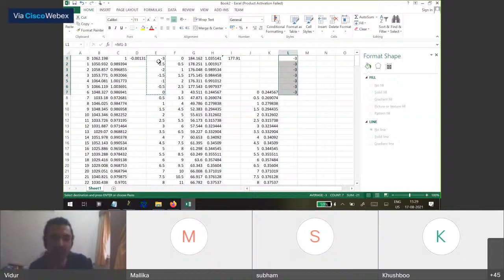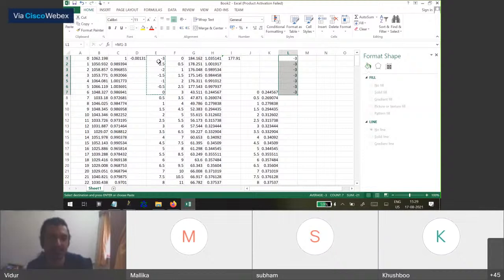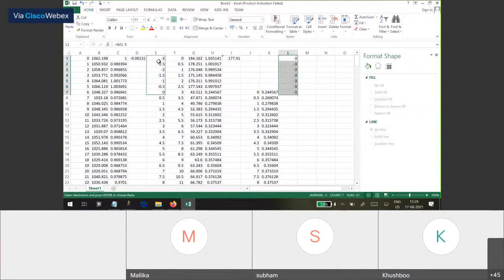So Tejal, there could be 2 errors. One is that you didn't specify the cell. The second, Akshay answered. So once you have these numbers, now we can correct for acquisition bleaching.